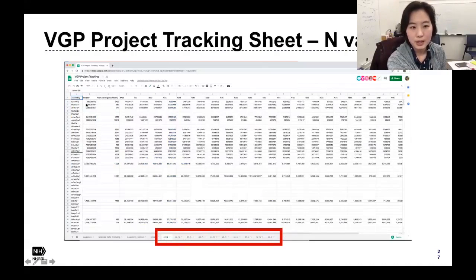So this here is again the identifier, and from here these are the total number of bases, total number of either contigs or scaffolds, the maximum size of the unit, and the N values here. You can see, for example, here, this is Marcella's sloth genome. The maximum contig size was 57 megabases, and for the N50 value, I see that something went wrong here, so it's something in between these two values, I think. Yeah, so it's around 8 or 9 megabases, I think.